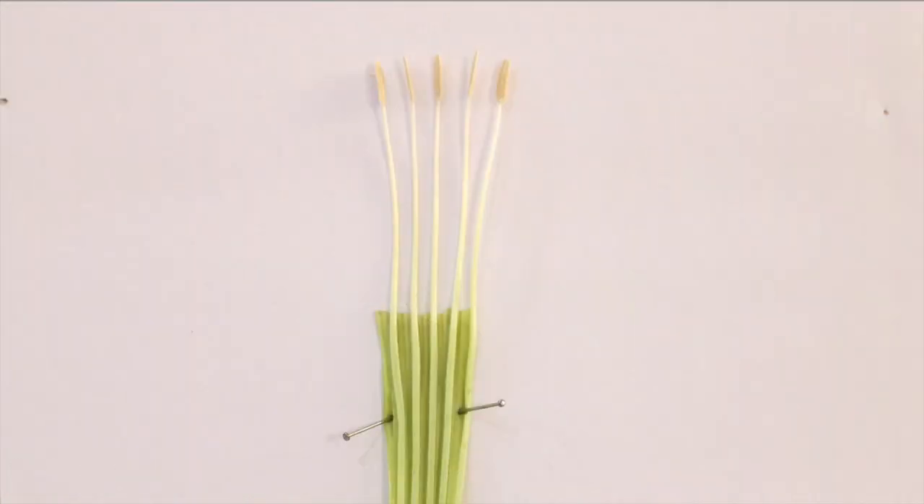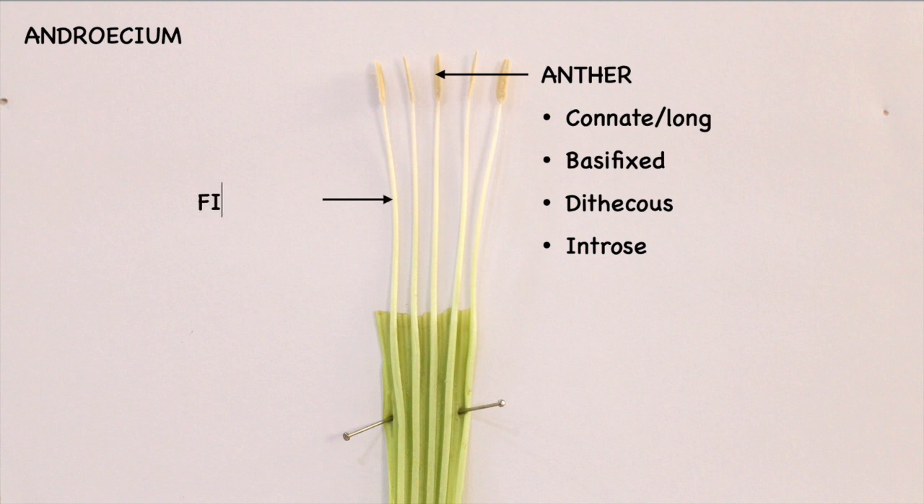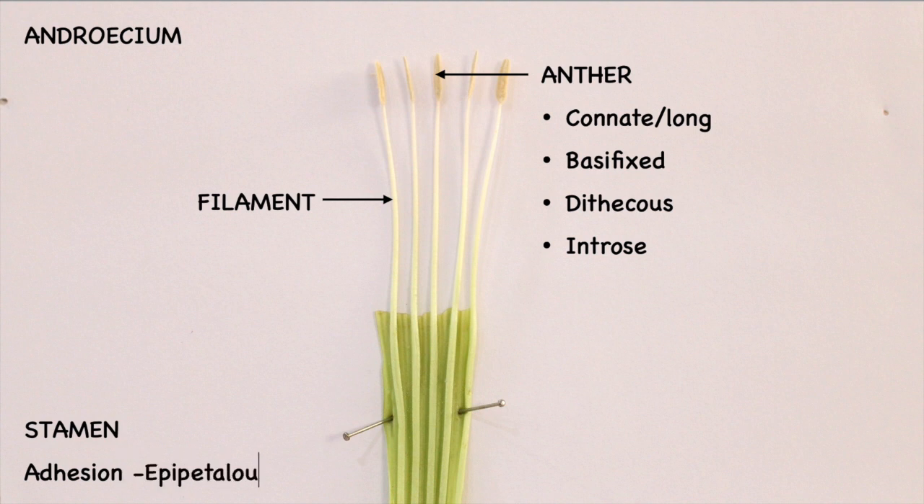If we look at the structure here, we can see that the stamens show the presence of a long or connate anther, which is basifixed, dithecous, and introrse. The filaments are long and they are attached to the petals, so the adhesion is epipetalous.